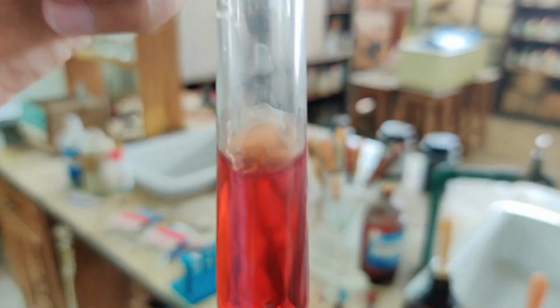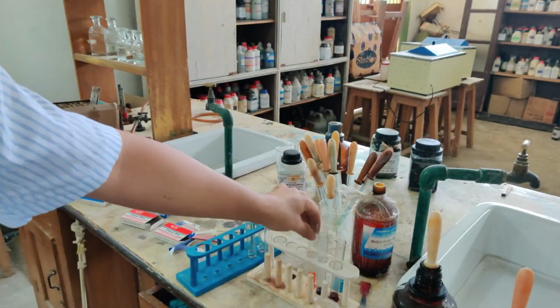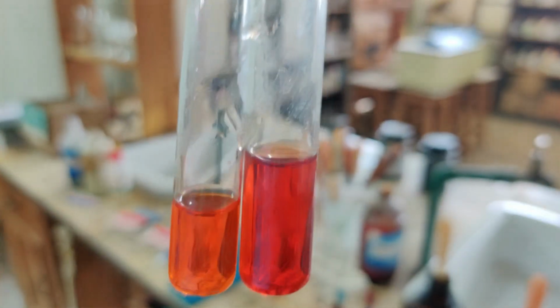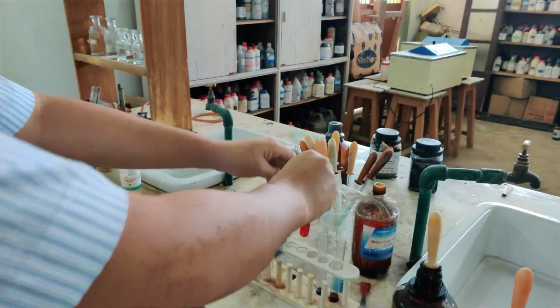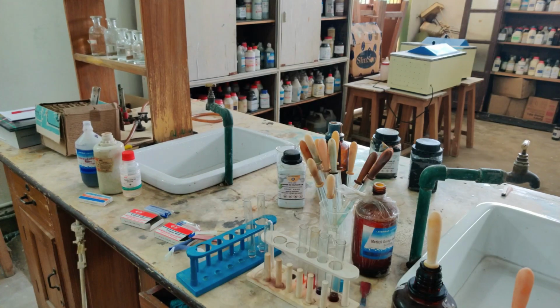Now you may say, sir, all three colors were the same. So to show you that there has been some color difference, let me take the other one. You can see here the two. So there it is, the two of them. There is definitely a color difference, as you can see, between the two test tubes. One I had tested with acid and the other one I had tested with base. One we will take as yellow and the other one as pink. So that was methyl orange.